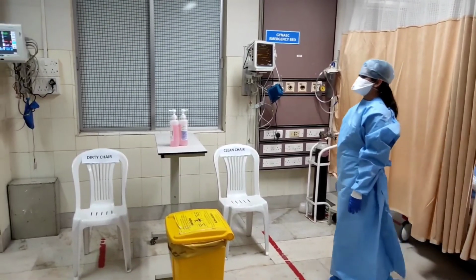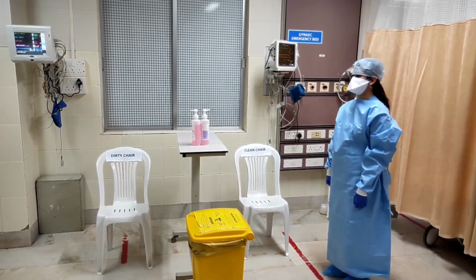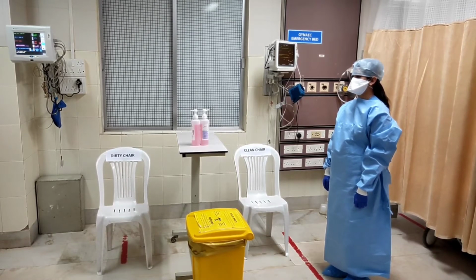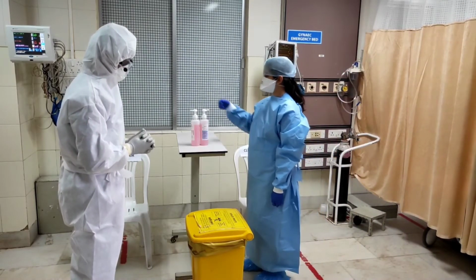Once the spotter has worn their PPE, they will come out onto the doffing area and give you the signal to come out of the decontamination area. Once you receive the signal from the spotter, then only you should come into the doffing area, not before. Once in the doffing area, follow the instructions given by your spotter.